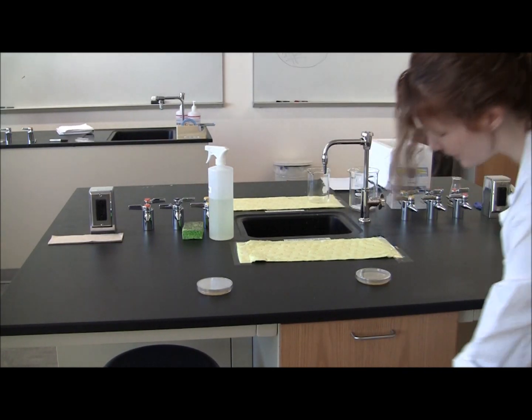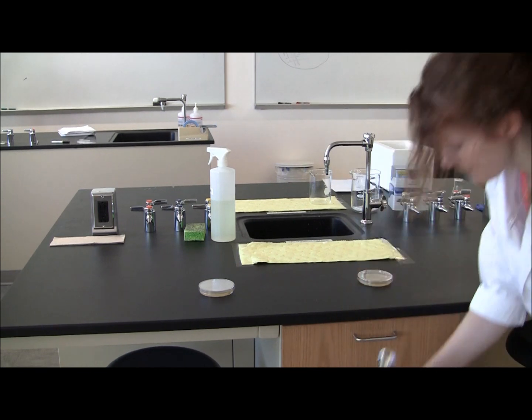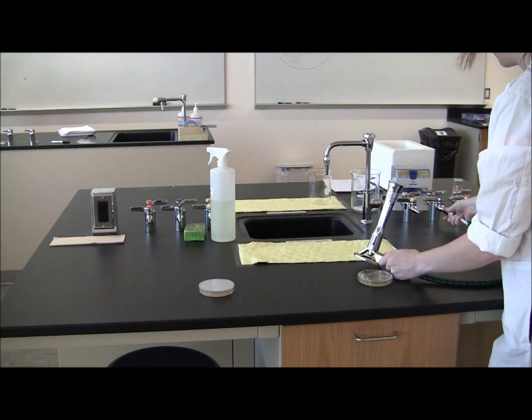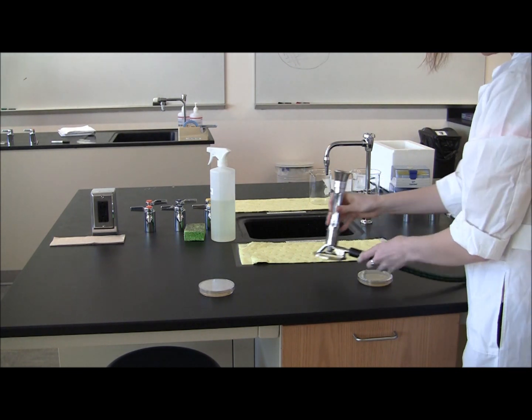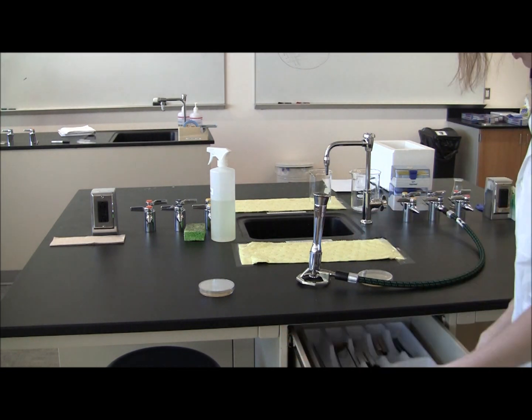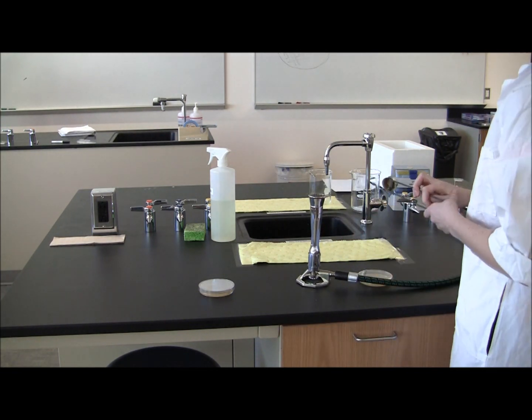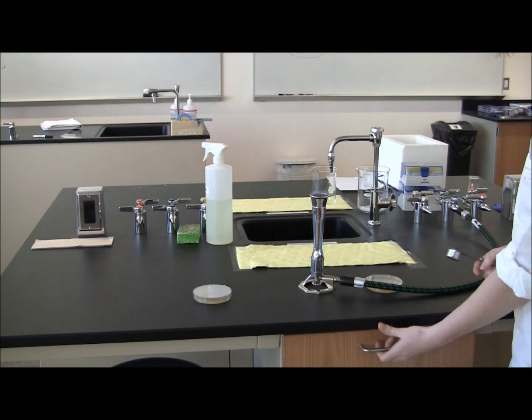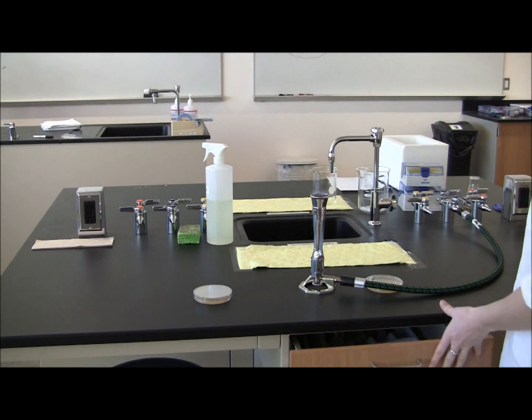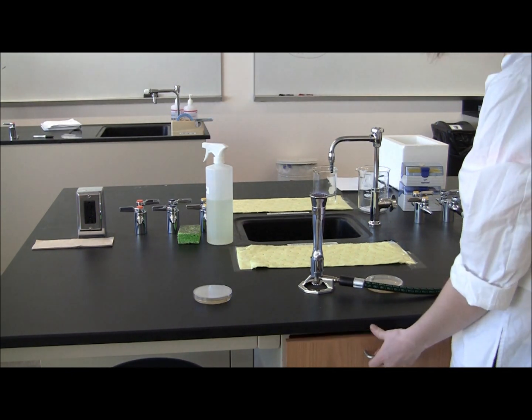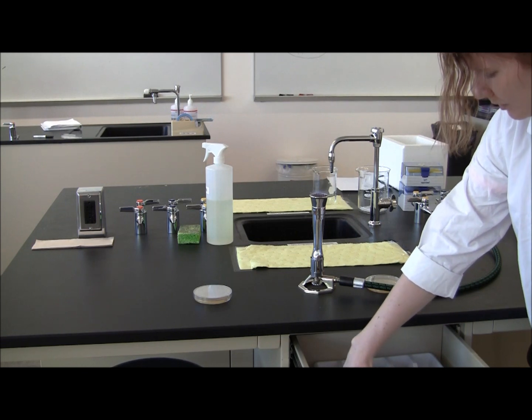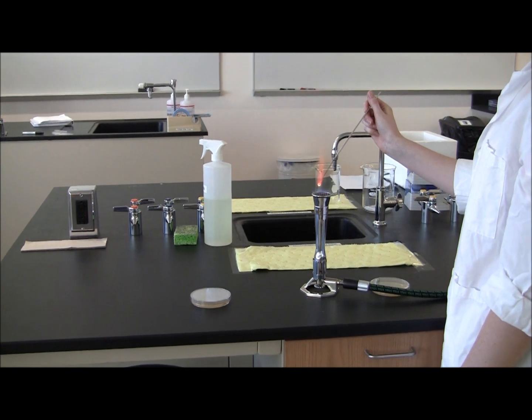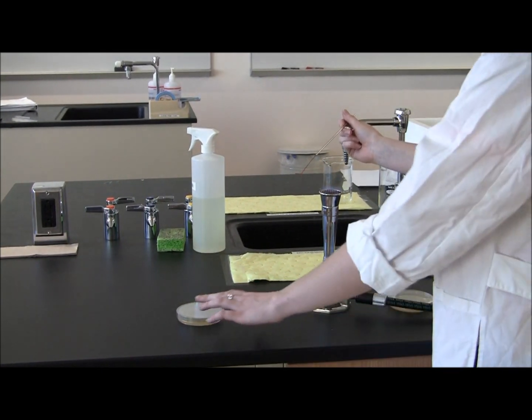First you need to take the Bunsen burner out, which is in the very bottom drawer. You need to plug it in nice and snug on the blue gas nozzle. Then take the striker out of the drawer, turn the gas on full, and light the gas using the striker. You won't be able to see the gas because it is natural gas in these labs. Then you'll take out your loop and flame it until it's red hot.